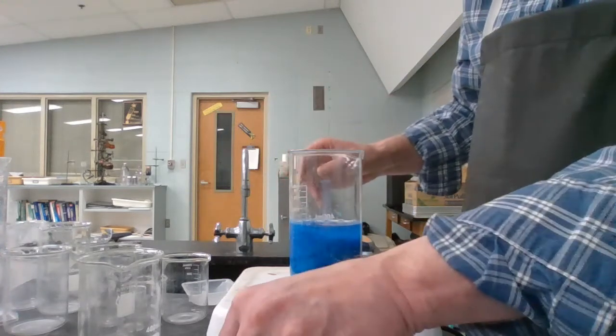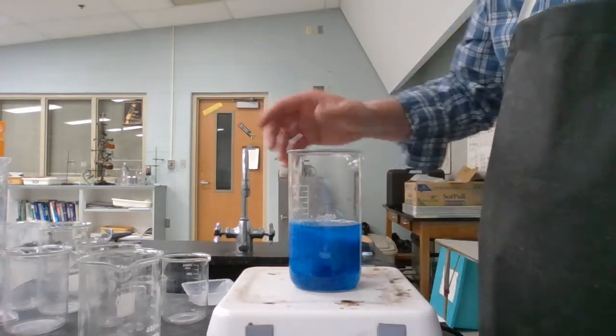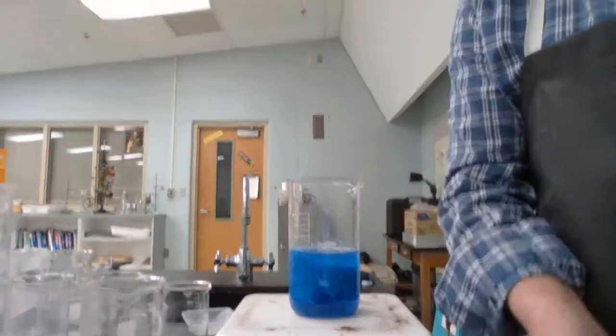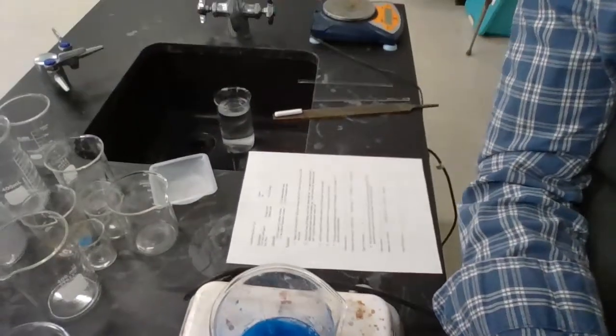Now we're going to heat it. We'll turn on the heater. We don't really need to stir it. And we'll see what happens here. Let's get a look down on it. Oh yeah, good stuff there.